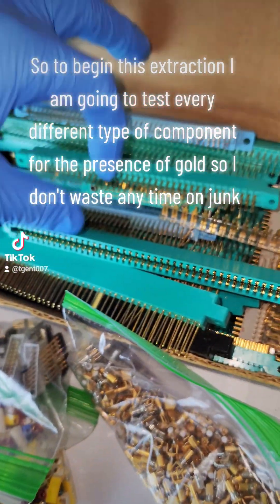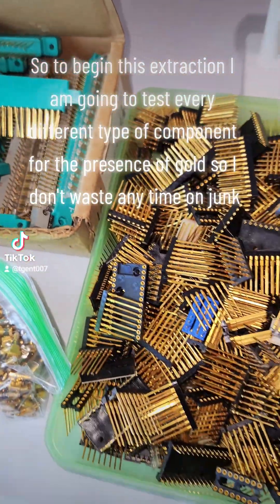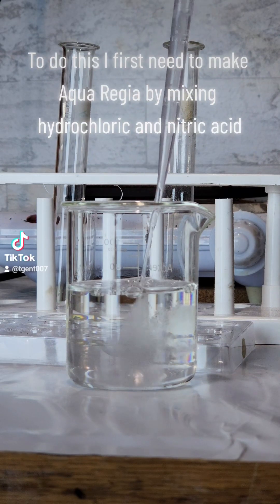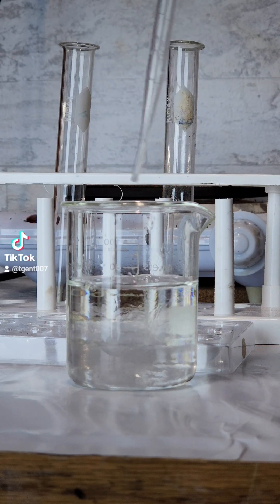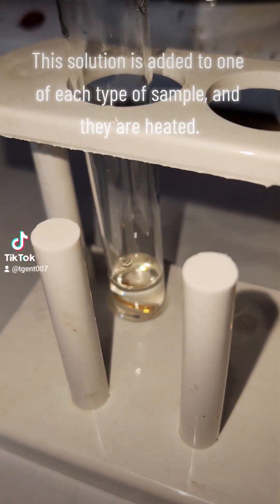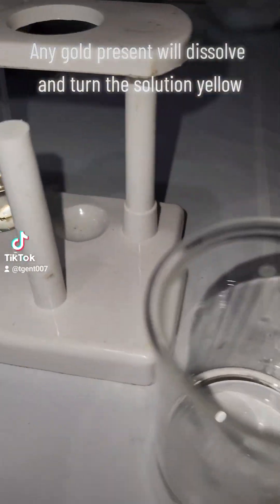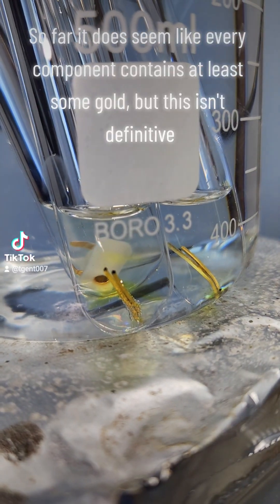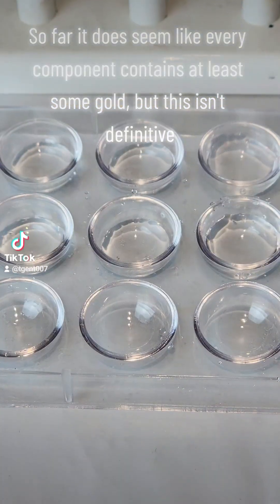To begin this extraction, I am going to test every different type of component for the presence of gold so I don't waste any time on junk. To do this, I first need to make aqua regia by mixing hydrochloric and nitric acid. This solution is added to one of each type of sample and heated. Any gold present will dissolve and turn the solution yellow. So far, it does seem like every component contains at least some gold, but this isn't definitive.